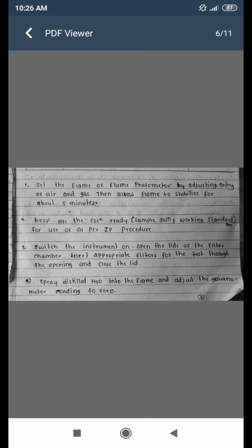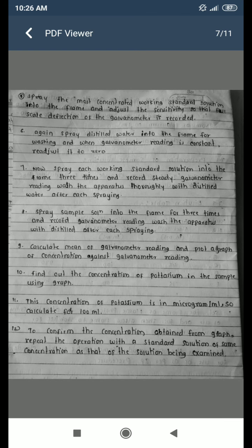Spray distilled water into the flame and adjust the galvanometer reading to zero. Then spray the most concentrated working standard solution into the flame and adjust the sensitivity so that full-scale deflection of the galvanometer is recorded. Again spray distilled water into the flame for washing, and when the galvanometer reading is constant, re-adjust it to zero.